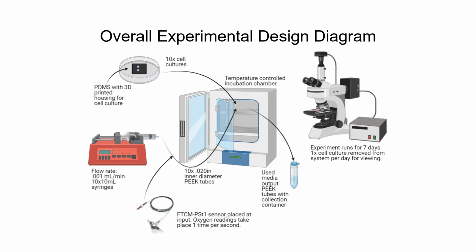The cell cultures will be placed in a large incubation chamber that is temperature controlled. The experiment will run for 7 days and one cell culture per day will be removed for viewing in the microscope to observe the effects of axonal hypoxia.